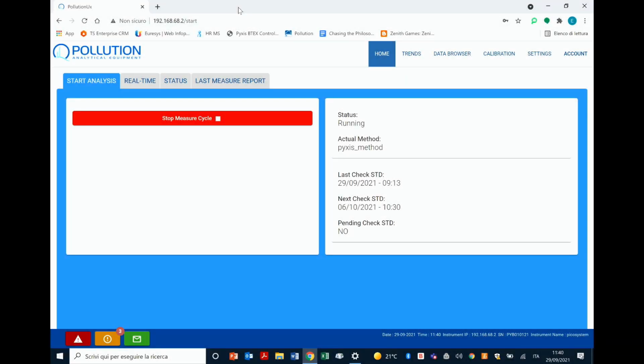Hi, and welcome to this PyxisGC tutorial video. In this video, I'll show you the Autocheck features, how to set them up, and the calibration database.